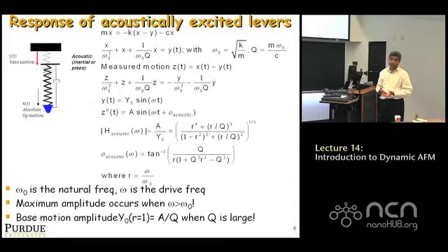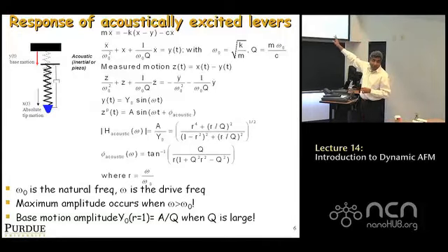Okay? So many people make this mistake and say it's not... no, you can choose omega to be equal to omega 0. That's your choice. But it responds at the frequency at which you're exciting it. Okay. So, a simple analysis, you can do Laplace transforms and get a solution for this equation.